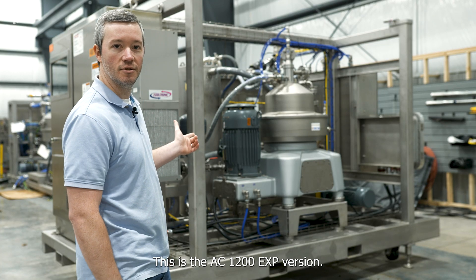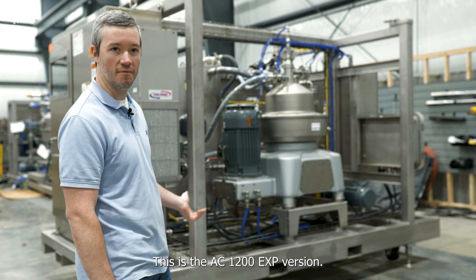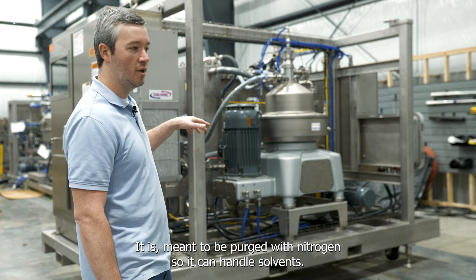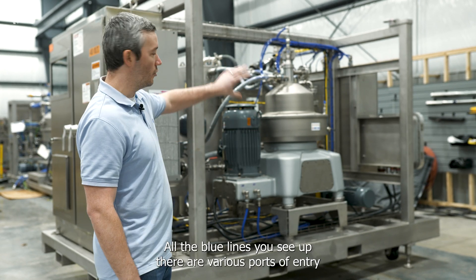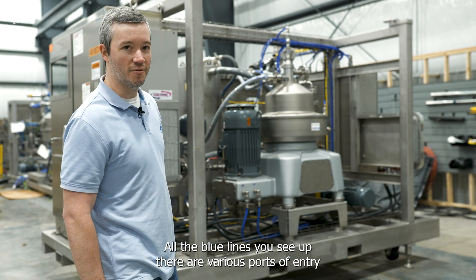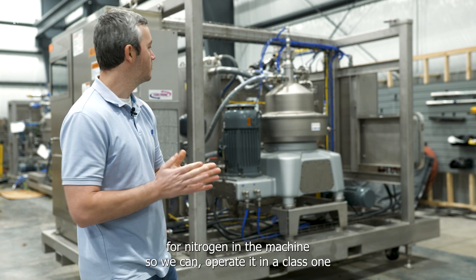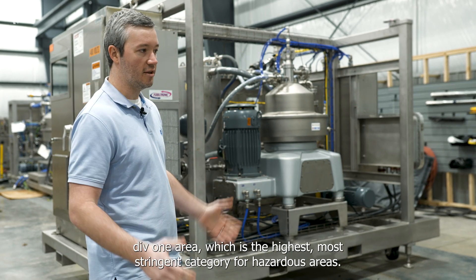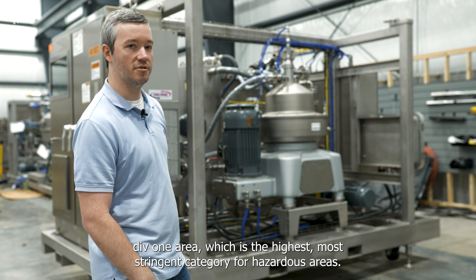This is the AC1200 EXP version. It is meant to be purged with nitrogen so it can handle solvents. All the blue lines you see up there are various ports of entry for nitrogen in the machine, so we can operate it in a Class 1 Div 1 area, which is the highest, most stringent category for hazardous areas.